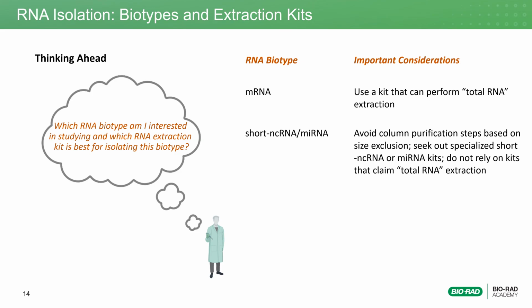In addition to extraction considerations, it is essential that RNA is not contaminated with DNA, since this cannot be distinguished from cDNA in the qPCR reaction, as prefaced earlier. To overcome this, most protocols rely on the use of DNase I treatment, which digests any DNA.